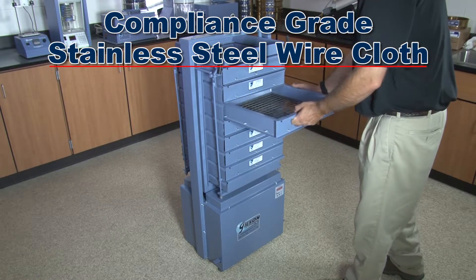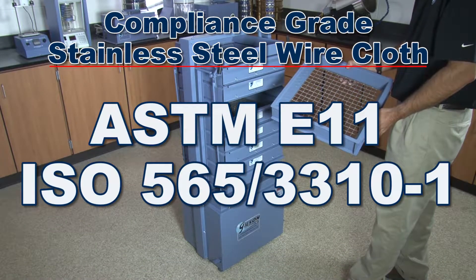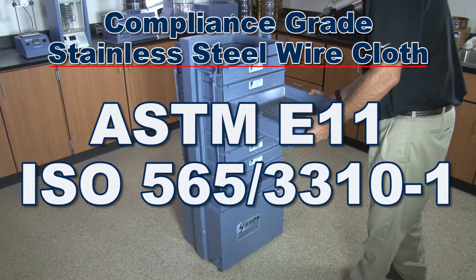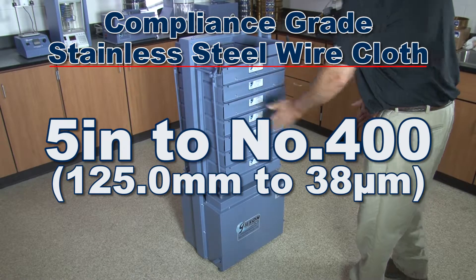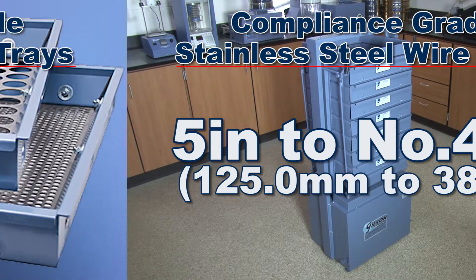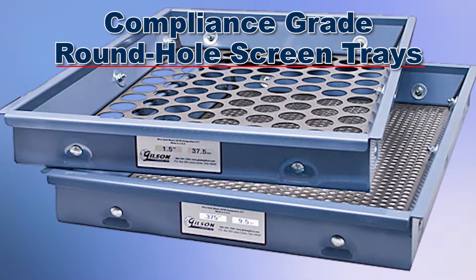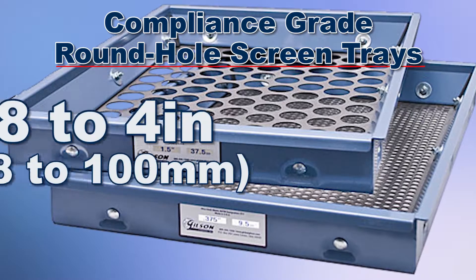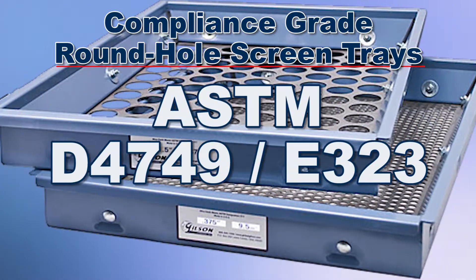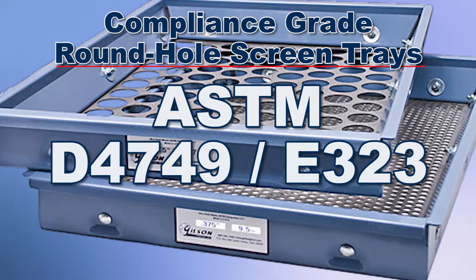Each screen tray is fitted with ASTM E11 or ISO 565 and 3310-1 compliance grade stainless steel wire cloth from up to five inches to as fine as number 400. Or ASTM round hole screen trays with precision punched round openings that range from one-eighth to four inches in accordance with ASTM D4749 and E323 requirements.